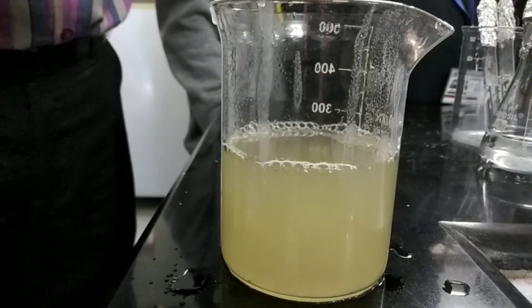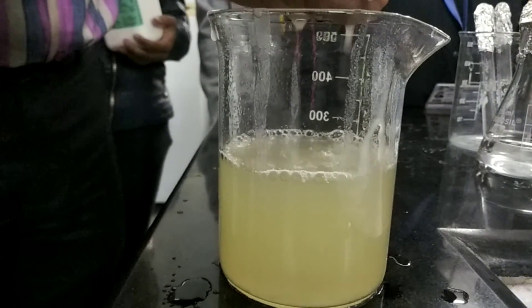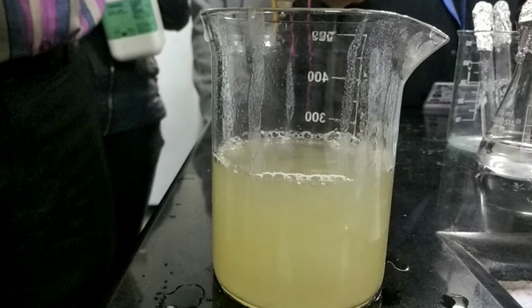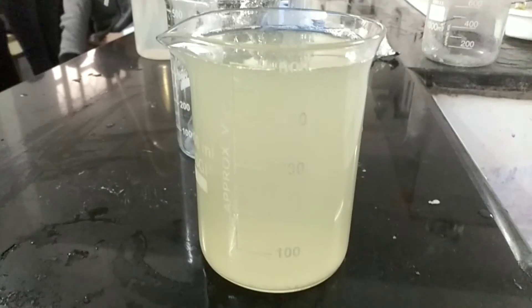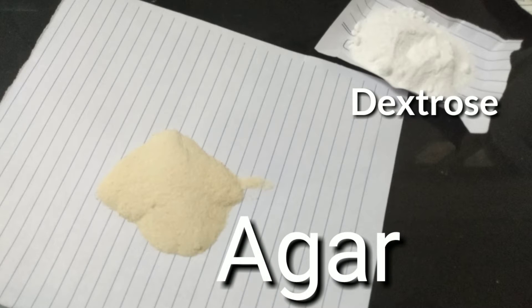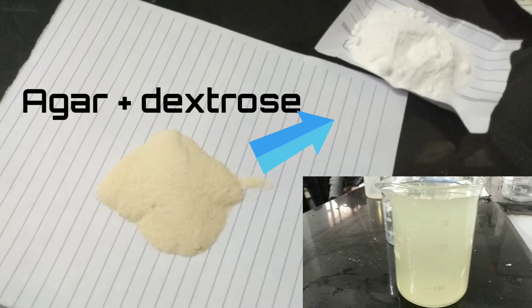You will notice a decrease in volume — we added 1000 ml of distilled water but the volume is less after boiling due to evaporation from the heat applied. We need to make up the volume by adding more distilled water to the potato infusion. Now our potato infusion is ready. We add 20 grams of dextrose and 15 grams of agar powder to the potato infusion to make the complete potato dextrose agar.